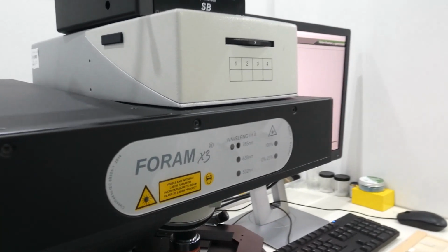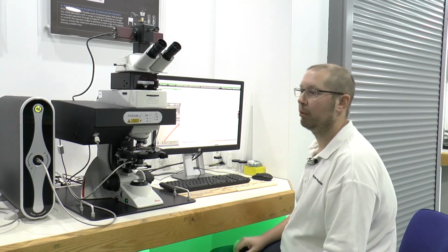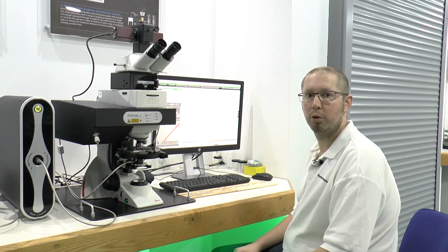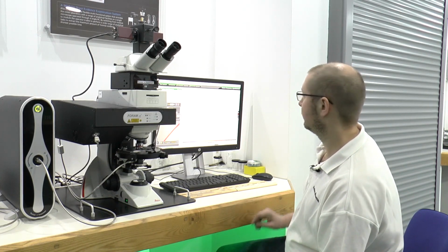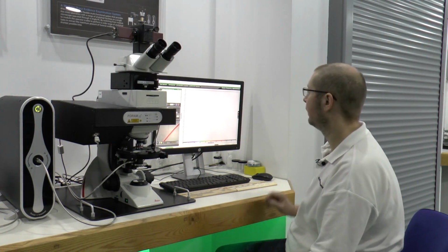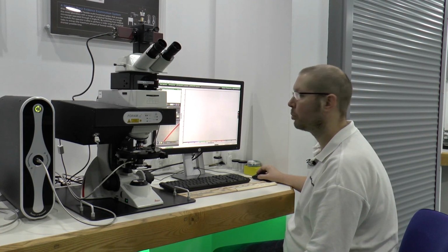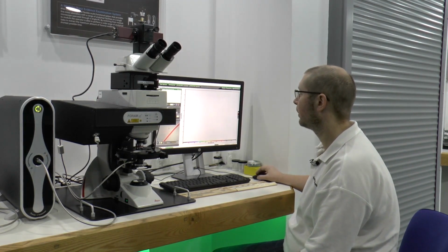Here we're going to take a look at the UV-Vis NIR microspectrometer. It records absorption and transmission spectra in the range of 240 nanometers to 1000 nanometers. We have a fibre here mounted on a quartz slide in glycerin, and we're going to use this system to take some absorption measurements of these fibres that are recovered from the crime scene.